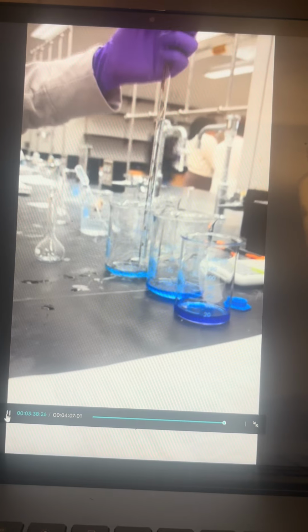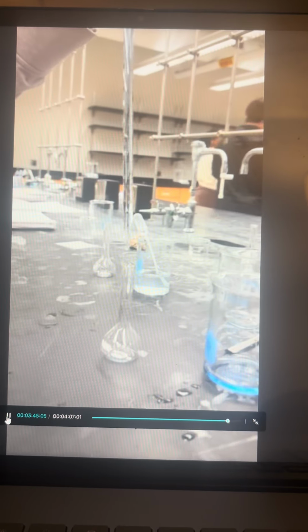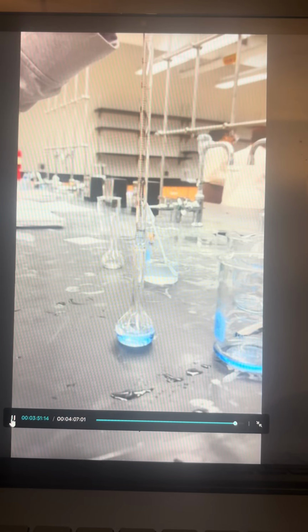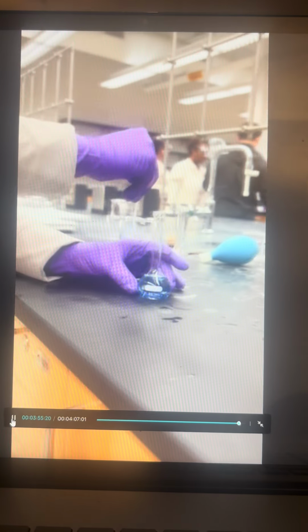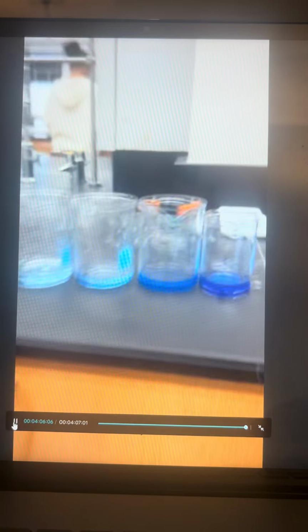We then begin our third dilution. Now, the reason why we are making 3 dilutions is more important to the second half of this experiment, which will not be shown in this video. We will be sending these solutions through a spectrophotometer, which will read the absorbance of light through these liquids. Now, the absorbance is very proportional to the concentration of your dilution.